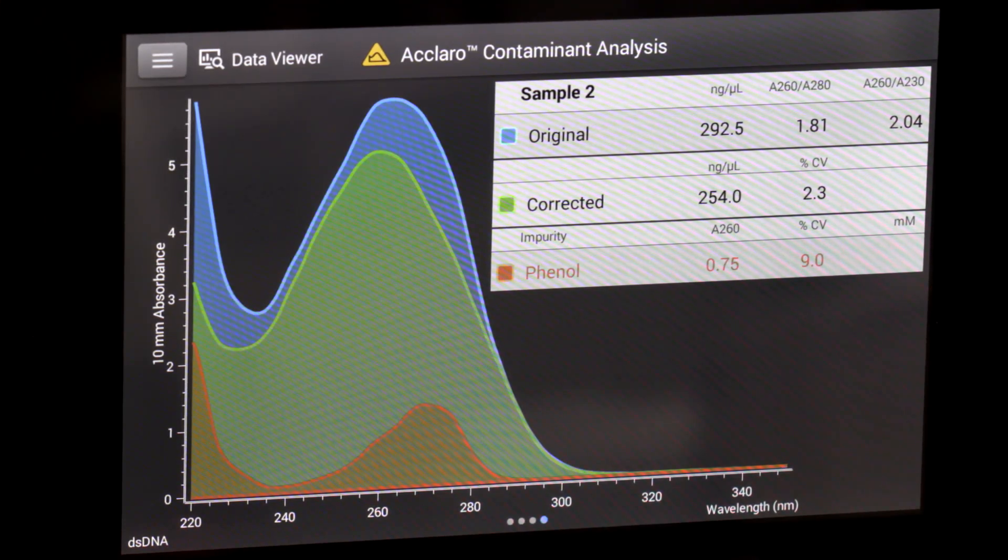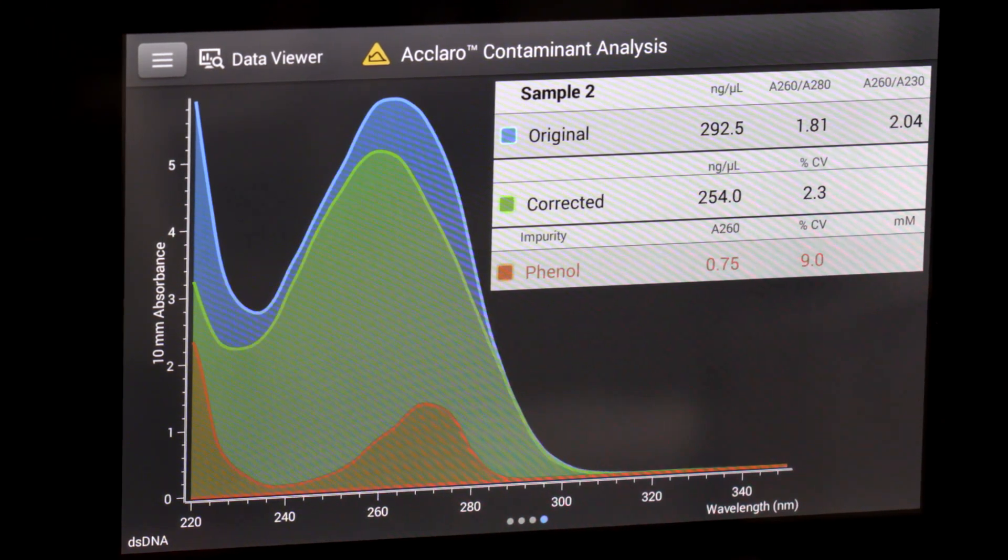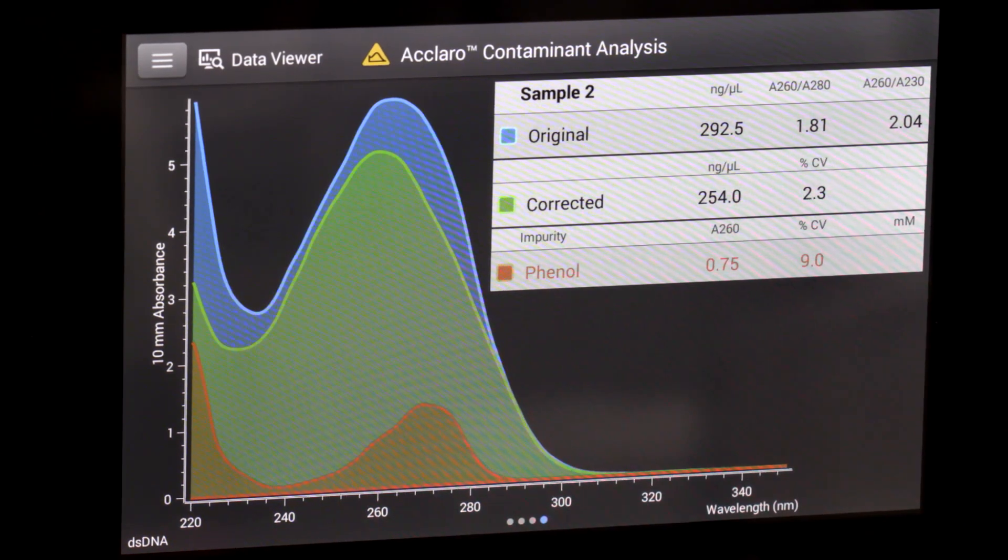We use chemometrics to take the whole spectrum and break it into its constituent parts. Some contaminants, such as phenol, absorb light at 260 nm, the same wavelength as nucleic acids.